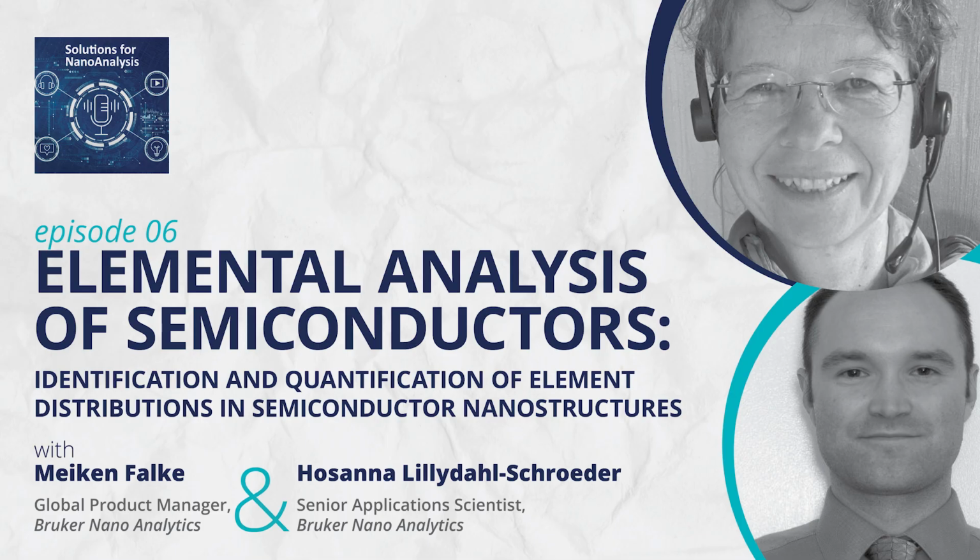And thinking of life science, life on Earth, there's this little remark on space. There I was also lucky once, I was part of an experiment together with Rhonda Stroud of the Naval Research Lab. And she looks at the combination or element combination of stardust. And this is, well, another thing where you don't know what you will get. And EDS was really powerful, identifying the combination of elements in the stardust.